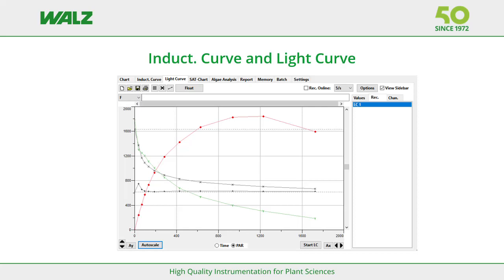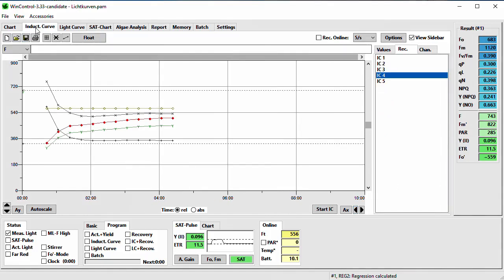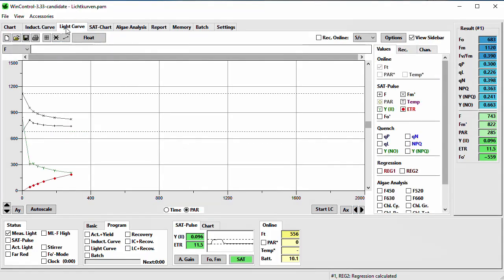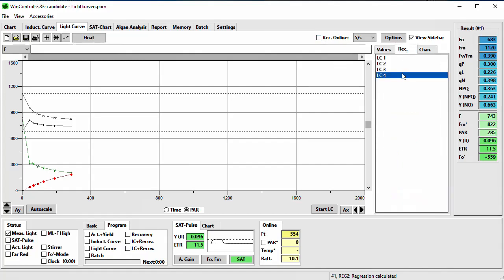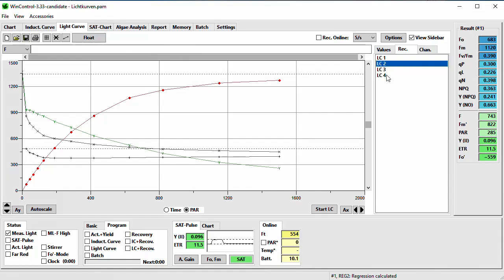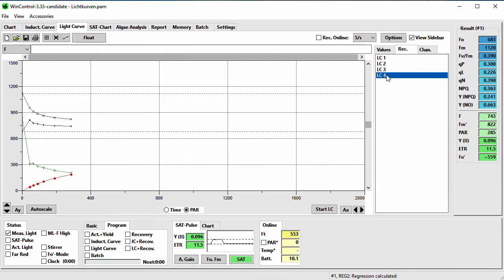I will now explain two tabs which have many functions in common with the chart tab: the Induction Curve and the Light Curve tab. These are modified chart tabs for their respective protocols, with only a few differences like the x-axis scaling and a button in the lower right corner that starts the induction curve or light curve protocol. The chart recording function is still available using the Record Online checkbox — all online values will be recorded and stored in a separate chart file. In the sidebar, Record will show only induction curves or light curves in their respective tabs, and a new record button does not exist as performing a protocol automatically creates a new record.